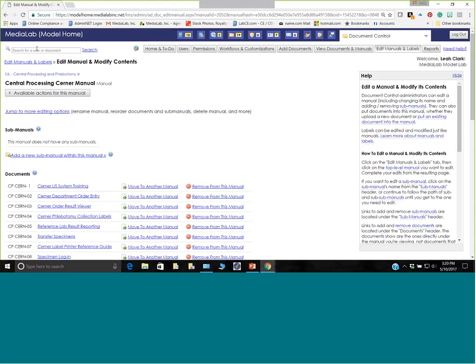If you look at the top left of your screen, there's a little search box. You can search keywords at any time, and it will pull document matches based on the title and also scanning the text. So if an employee needs to look up how to clean up a particular spill and they type in spill, they're going to see document matches on the title and on the body of the text. I can quickly just show you what that looks like.